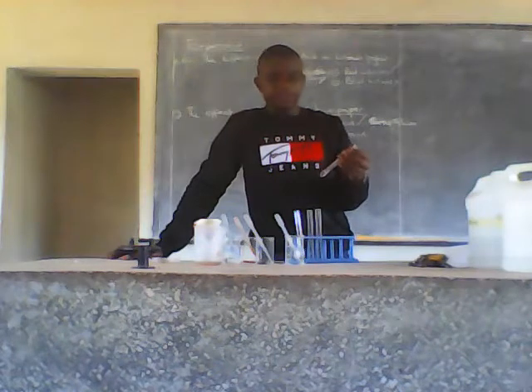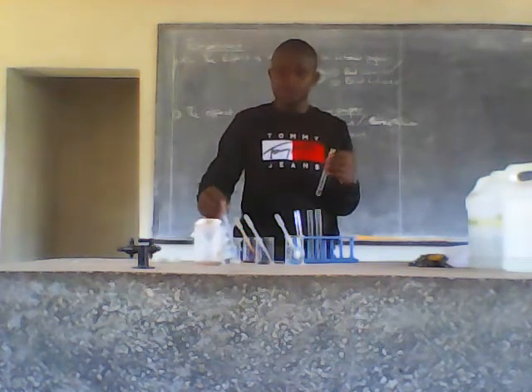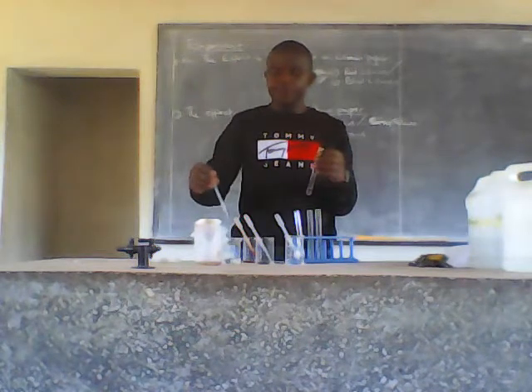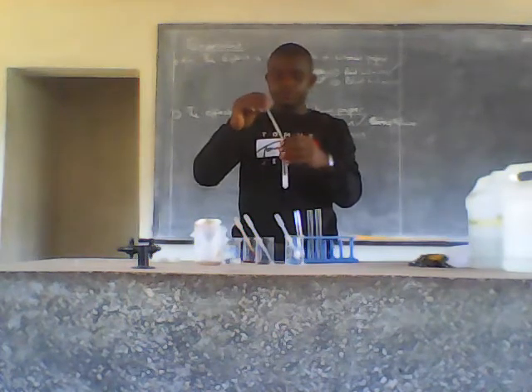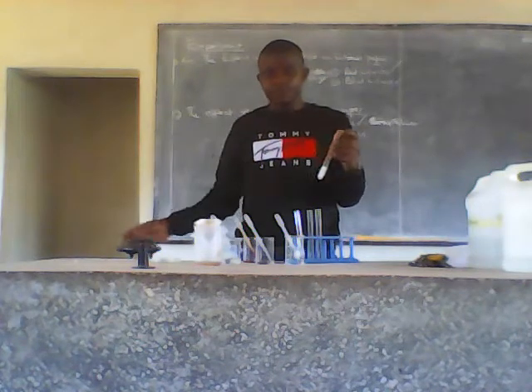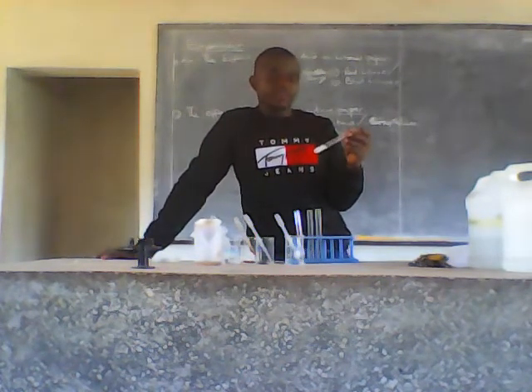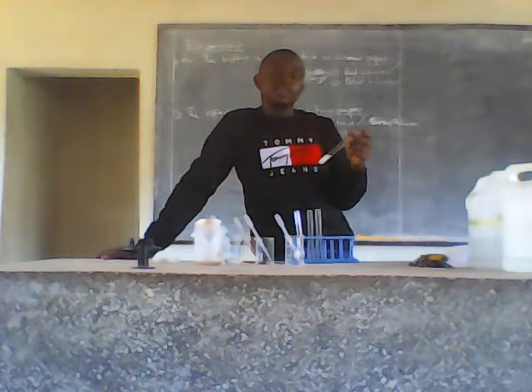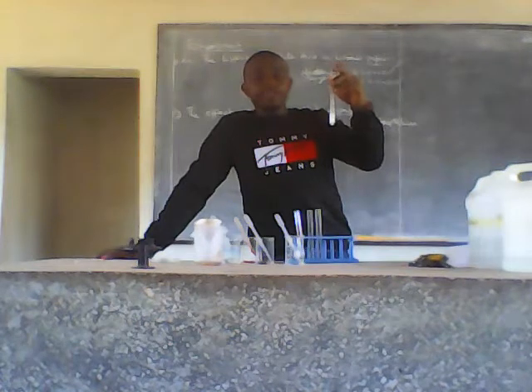Then, to my fourth test tube, I'll add 2 cubic centimetres of barium nitrate. After adding 2 cubic centimetres of barium nitrate to the fourth test tube containing the filtrate, I am getting a white precipitate.